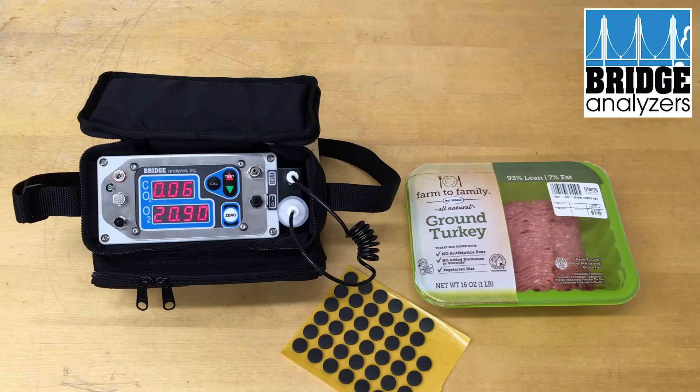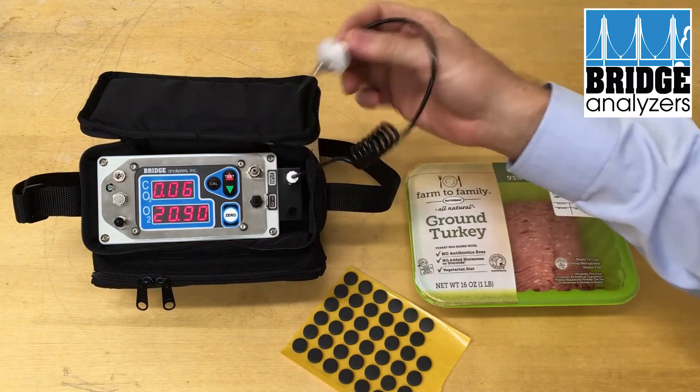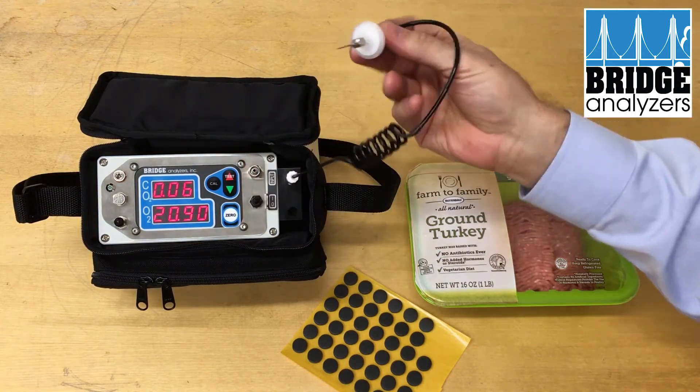We're just going to run a single test. In this case, we're in the discrete test and hold mode. Right now, we're not sucking any gas at all through the sample line.